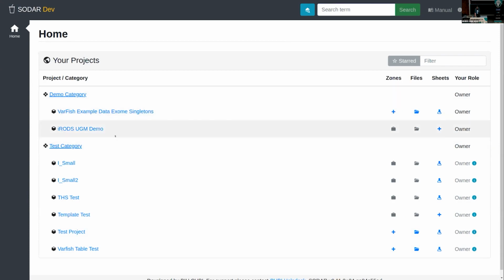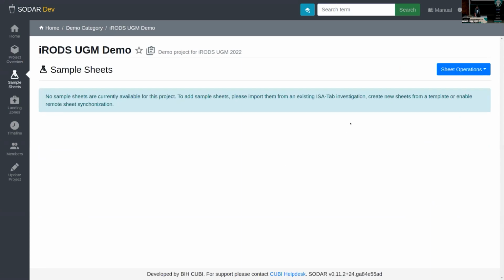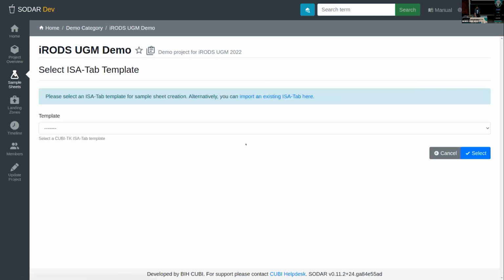Yeah, just going to show this is a list of test projects on my laptop. This is completely offline. I created this dummy UGM demo project, which has nothing in it except a hello world message. We go to sample sheets and there's nothing there, but we can create one. Let's do the generic template.